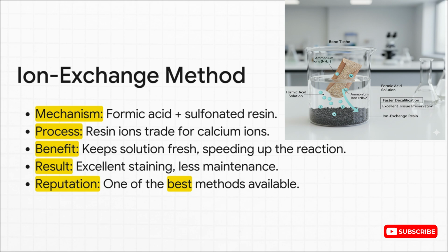The results are just beautiful staining, and you don't have to change the solution nearly as often. It's widely considered one of the absolute best methods for diagnostic quality.